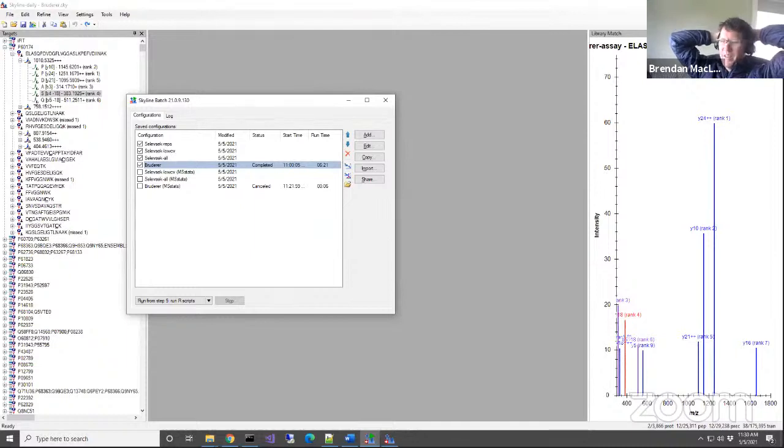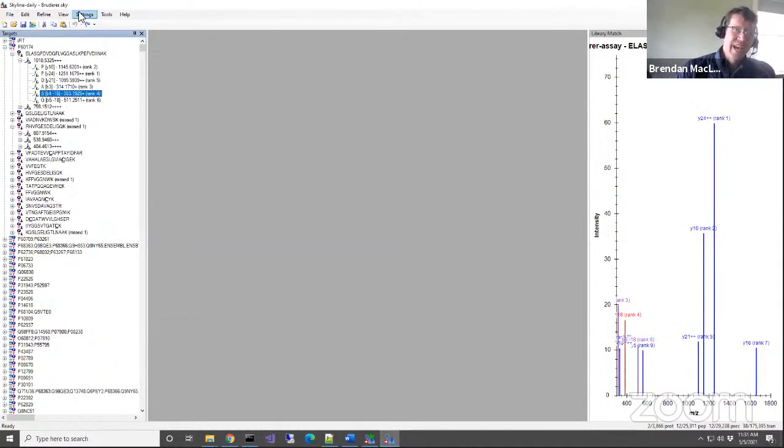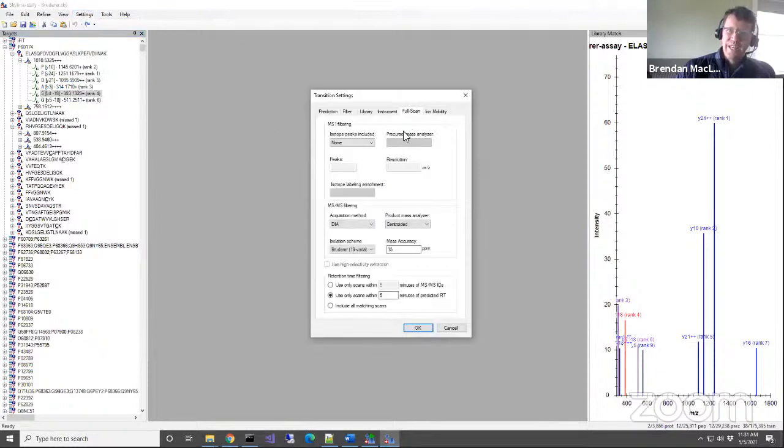And yeah, if you have a raw data file you want to analyze ahead of time, I would highly recommend that you just point Skyline at that. I can't say for sure that will always work. I did my best job and I haven't run into any files that have failed that.